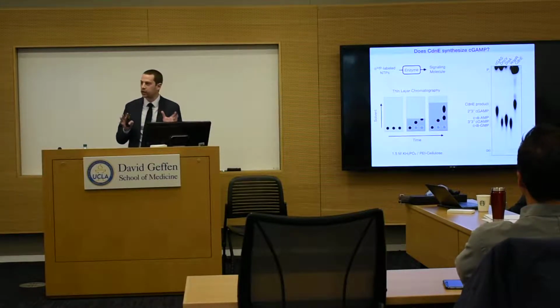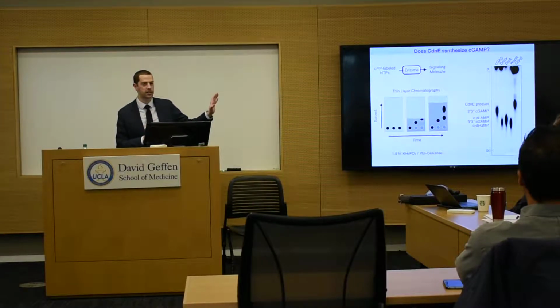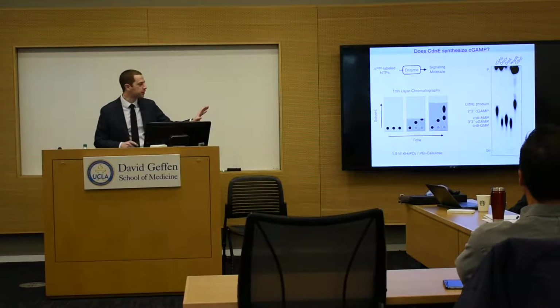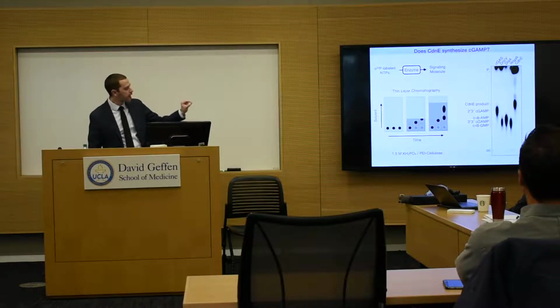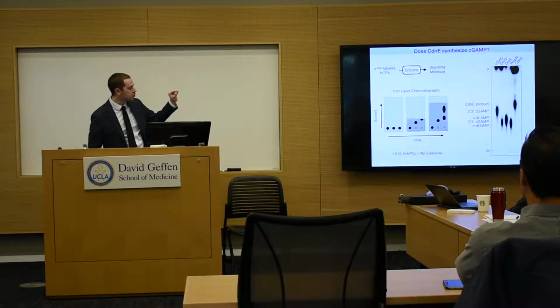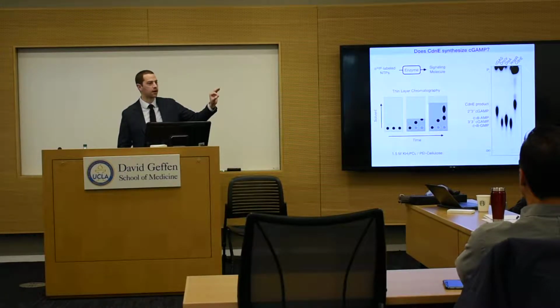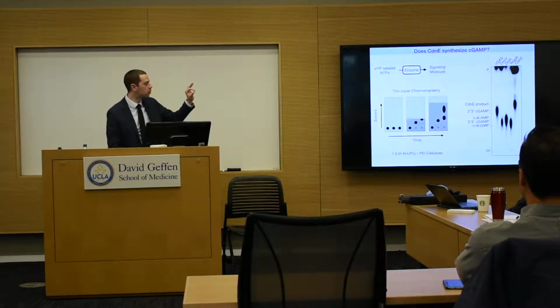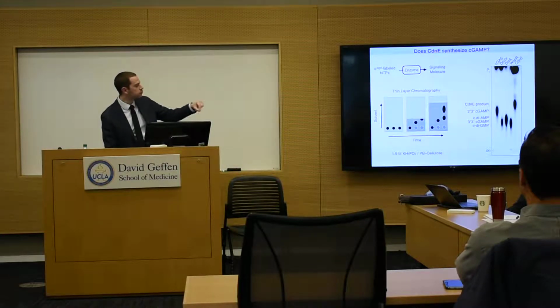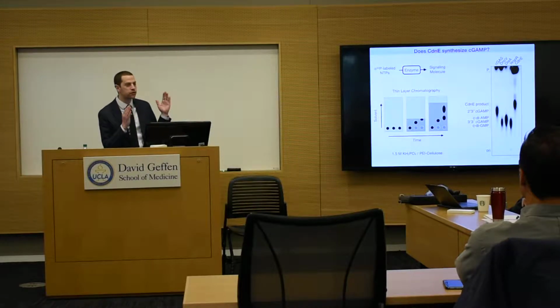The real data from that looks like this. So here I'm showing you what's a pretty complicated TLC, so I'm going to take you through it slowly. But here we're spotting different reactions, again along the x-axis at the bottom of the plate, and developing the TLC so that those reactions are separated as they travel vertically, and we're varying which enzyme we add to our reaction mix.